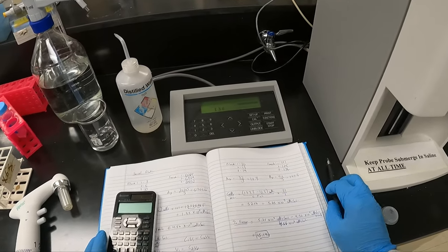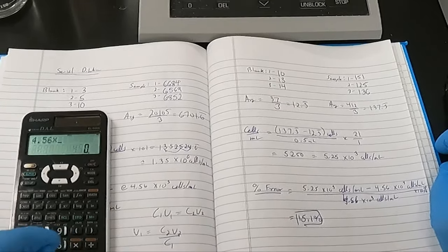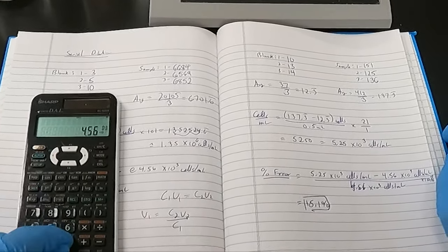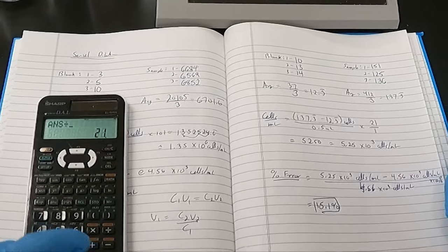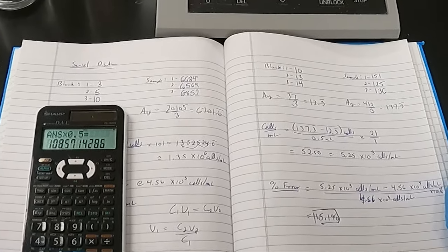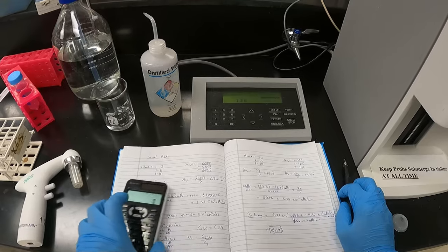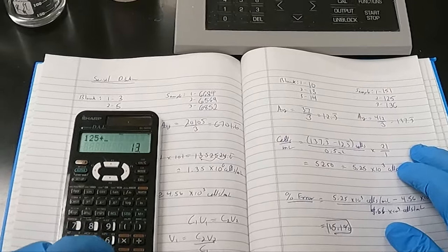I'm always looking to troubleshoot my experiments. Let's see what our average sample should have been to get 0% error. So we take the concentration we wanted, 4.56 times 10 to the 3. We will then divide by 21 and multiply by 0.5. I then subtract away my average blank, 12.33, and 120.9 is what I should have got to get 0% error. I got 137.3. Now notice the samples are a bit off.